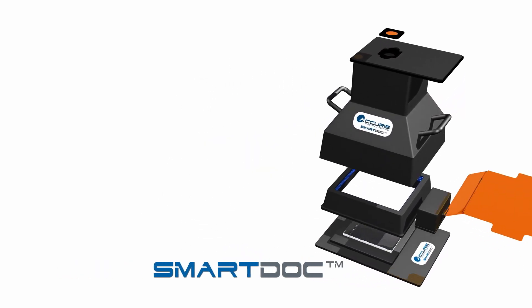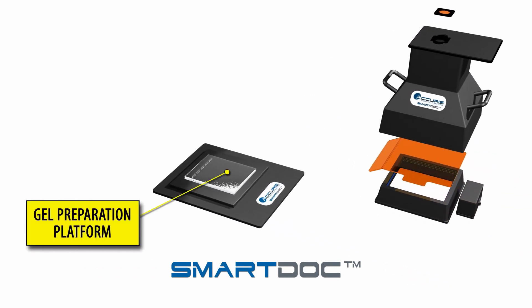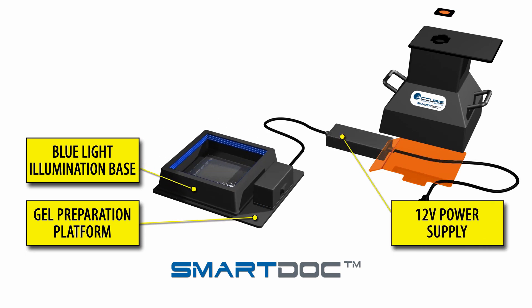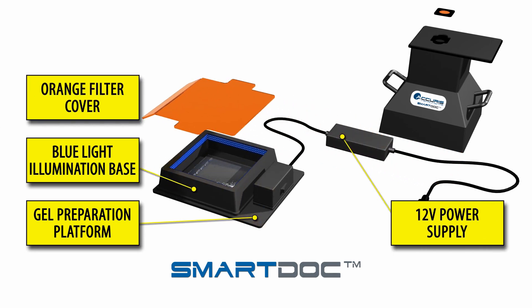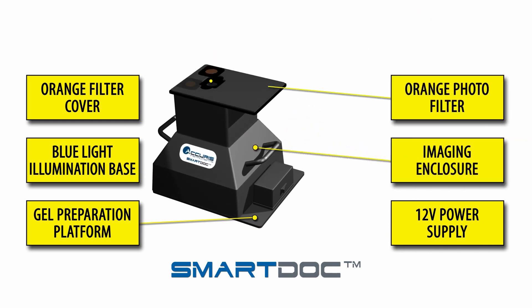Here's what's included with the SmartDoc 2.0 system: a gel preparation platform, a blue light illumination base including a 12-volt power supply, an orange filter cover, an imaging enclosure, and an orange photo filter.